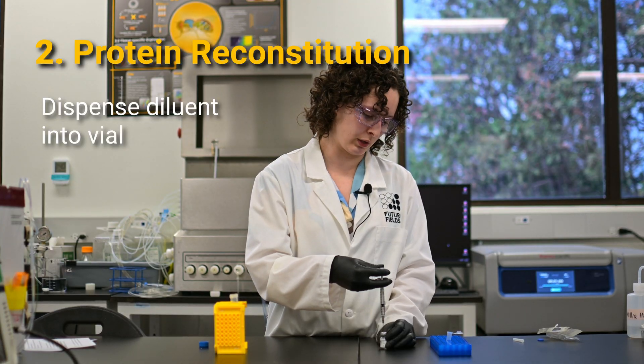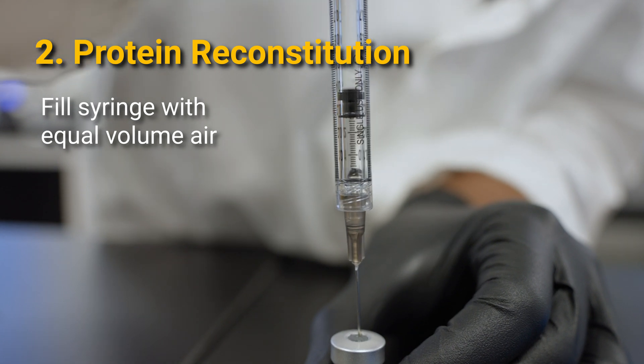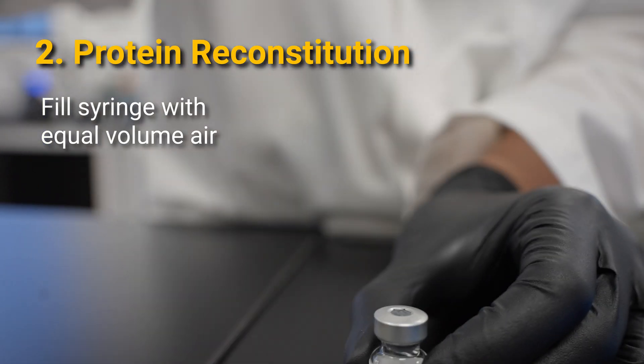Once you've dispensed all your liquid, fill your syringe with air approximately equal to the amount of liquid you dispensed to equalize the pressure, and then remove your needle.